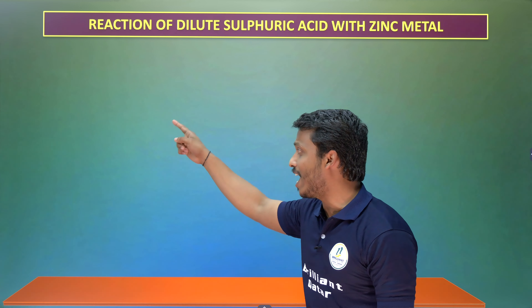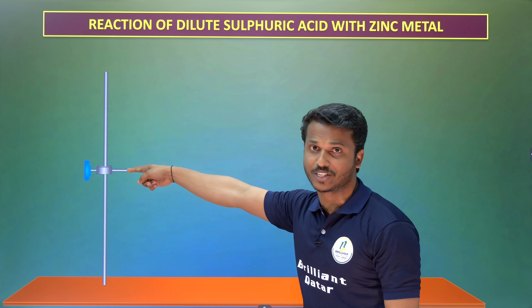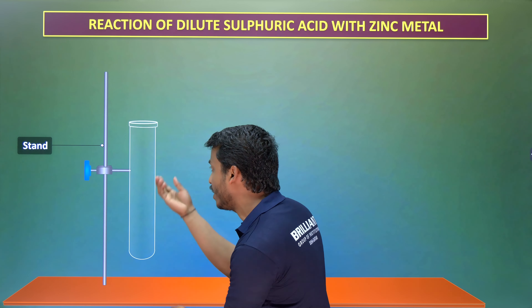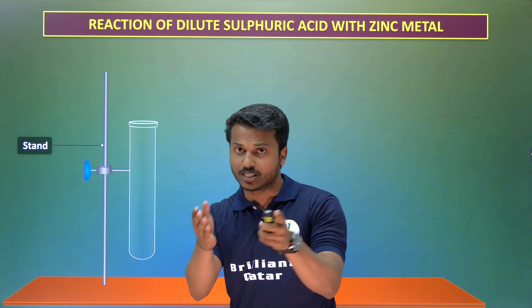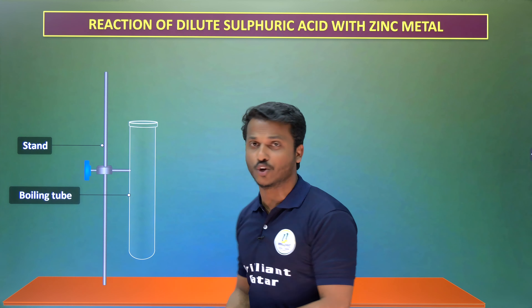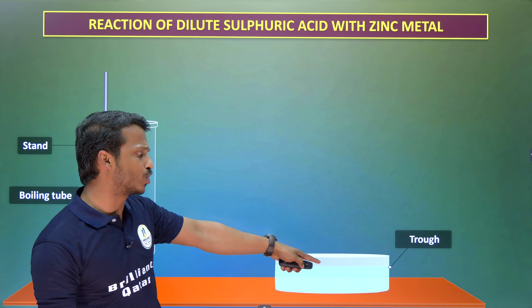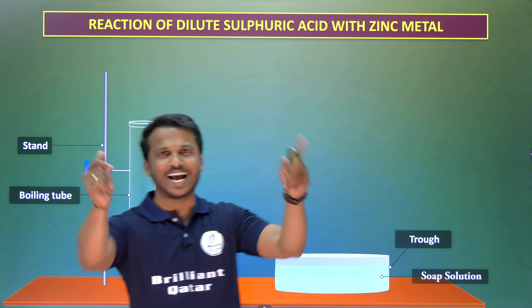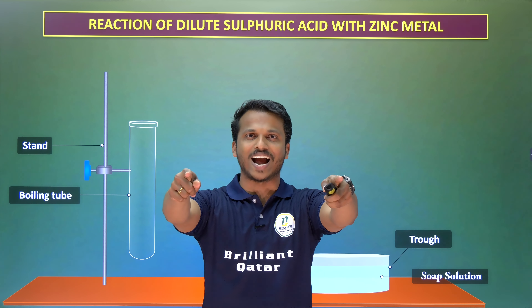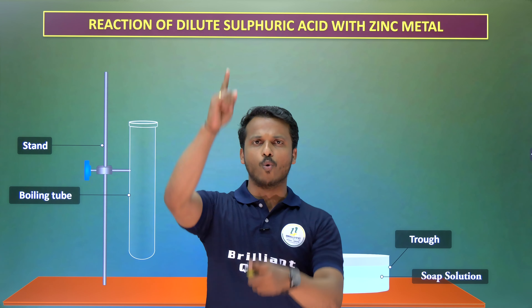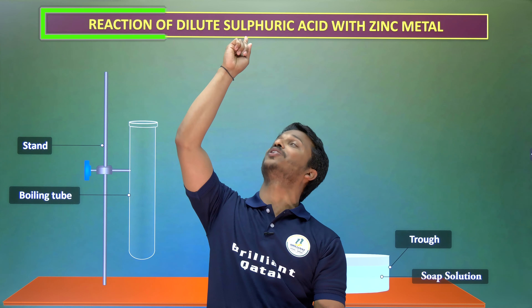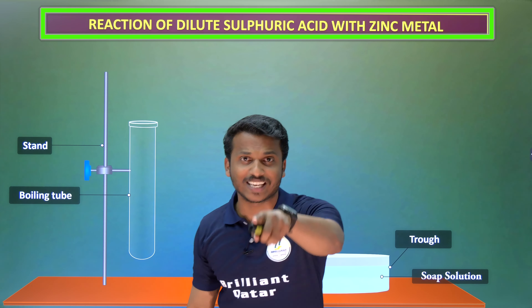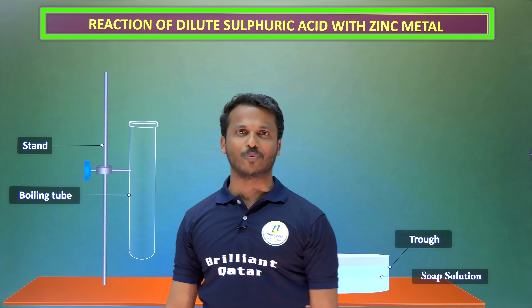Let me take one test tube stand, and here we have a boiling tube. We also have some soap solution. Let us start the experiment. What is this reaction? Can you read it?